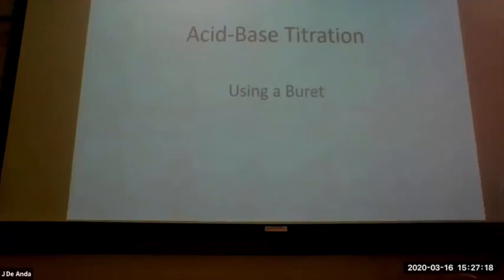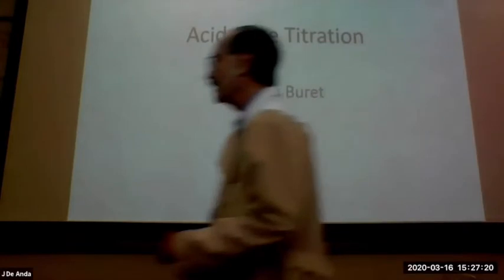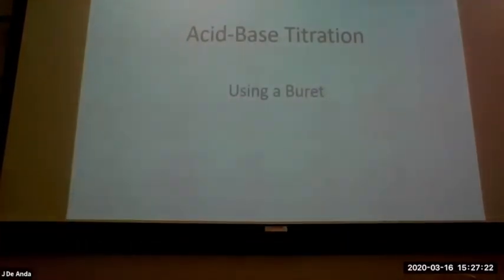So this is acid and base titration. I'm going to turn off this light here.